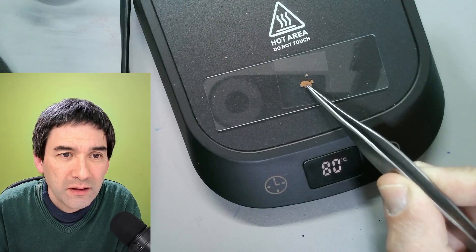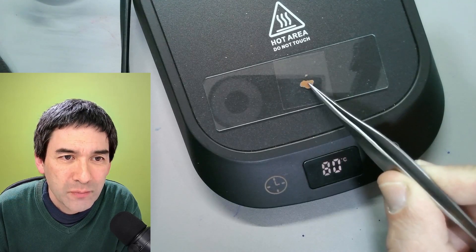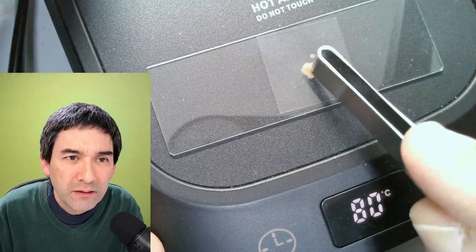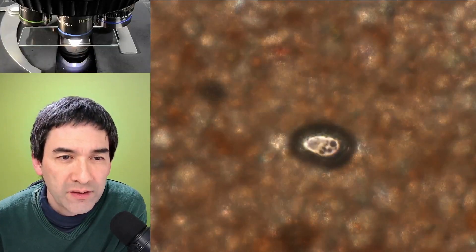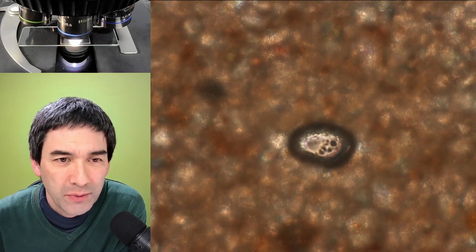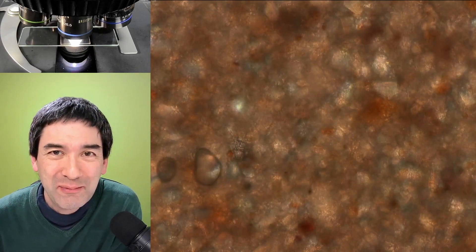It's still slowly starting to melt. Yes, it's much better. I think I can't get it any thinner than that. So that's the chocolate now. This is an air bubble, of course. But honestly, I have to tell you, there are probably more interesting specimens than chocolate.